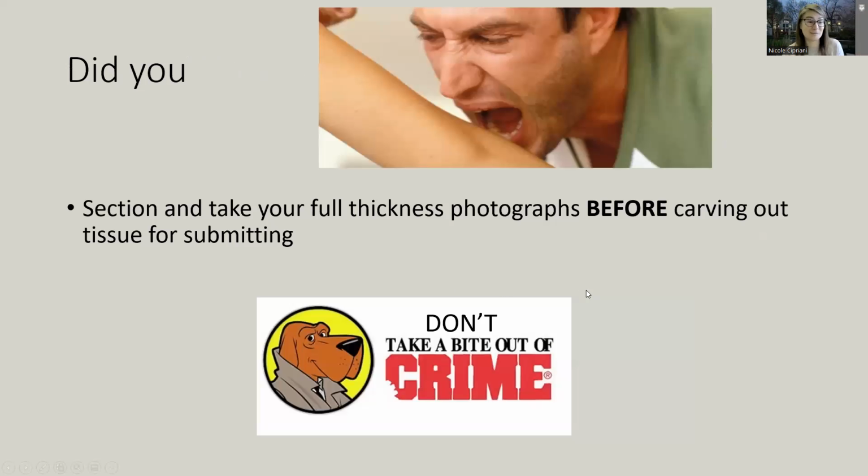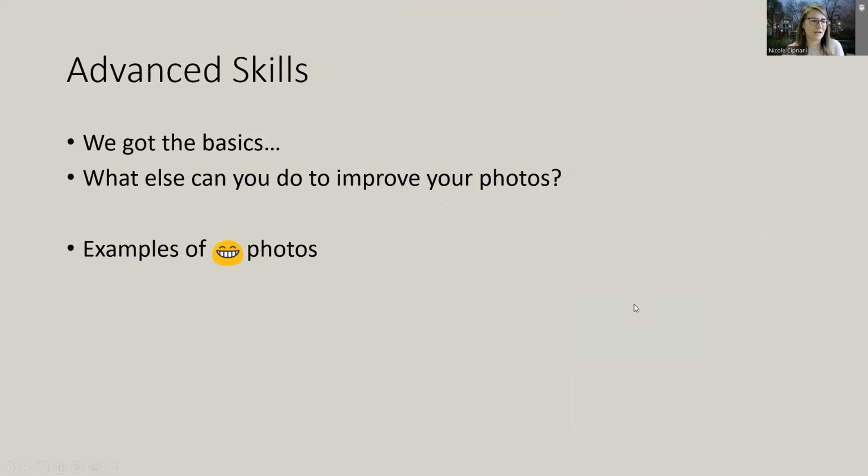I got a kick out of this because it just made me laugh. So, section and take your full thickness photographs before carving out tissue for submission. Don't take a bite out of the specimen. Okay. Hopefully you found that as entertaining as I did.